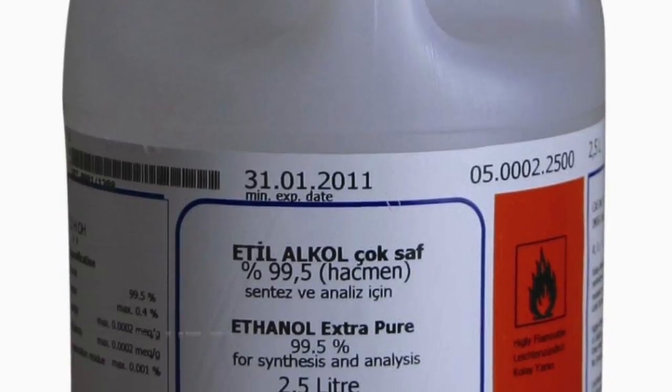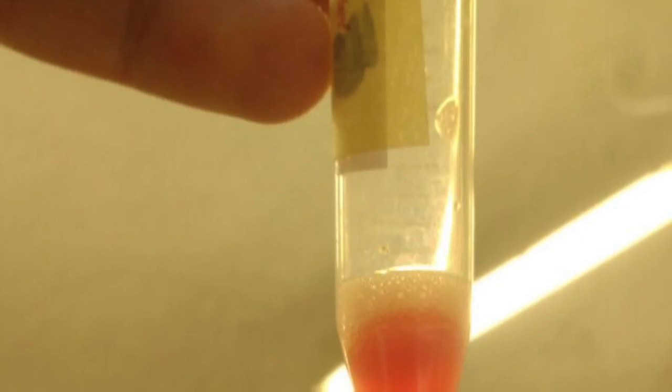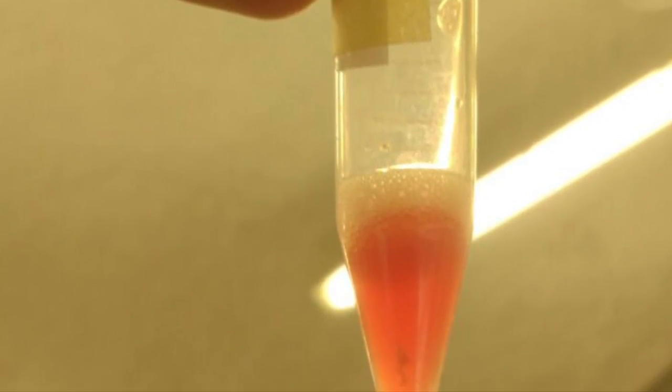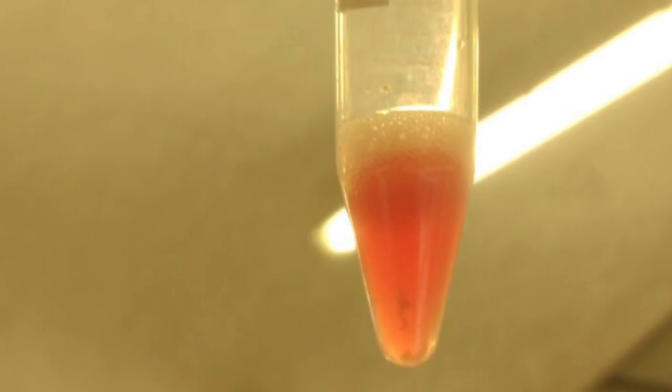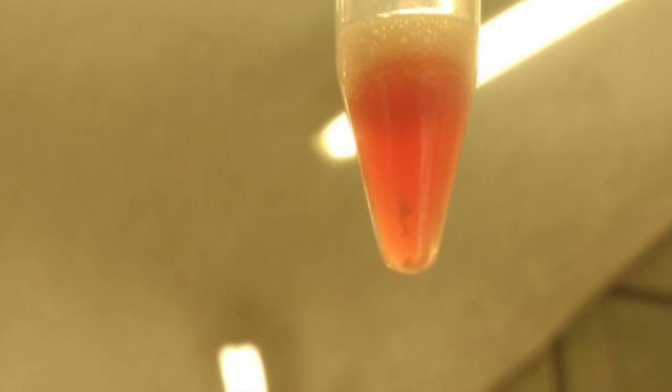At this point of the procedure a species of white speck was observed. The result was a complete disclosure and extraction of DNA of the human blood sample from the nurse of Gymnasio Campestre. The test tube evidences the double-stranded molecule as a tiny white speck.